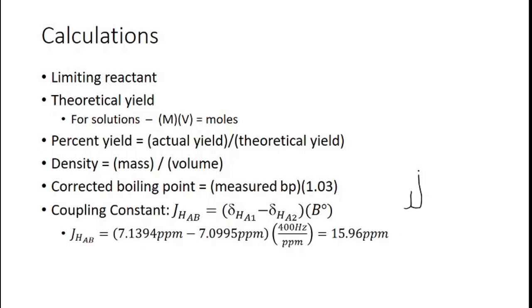So if you had a quartet, you would measure the difference between these two peaks, or these two, or these two, but they have to be adjacent peaks within that one multiplet.